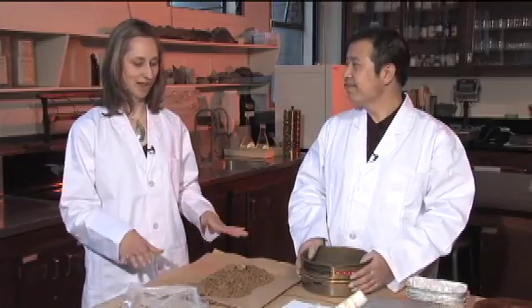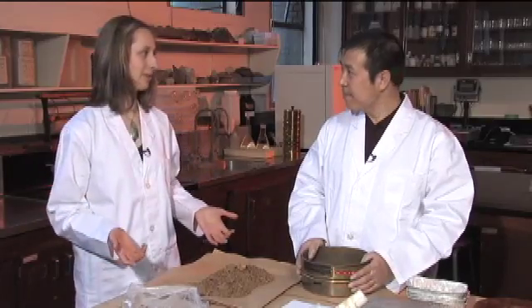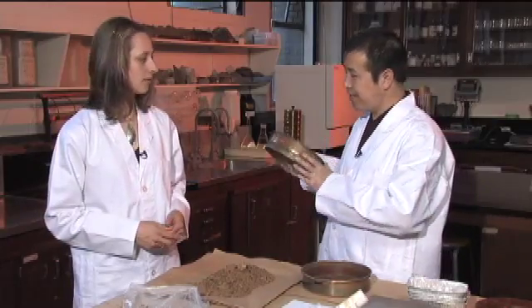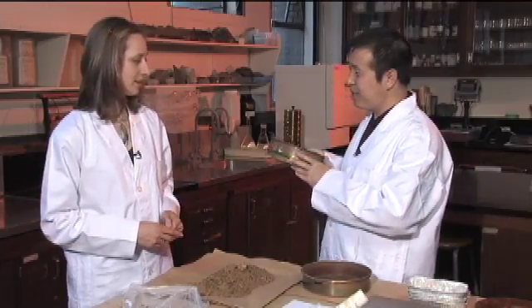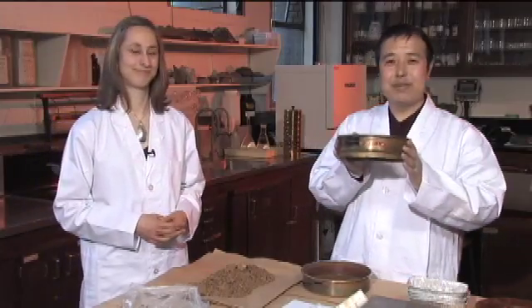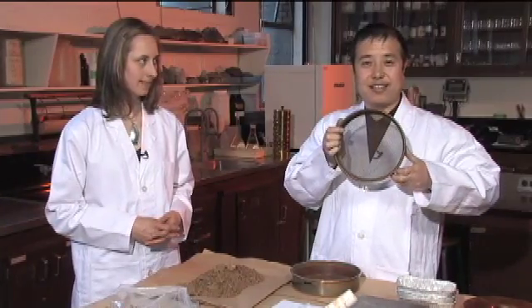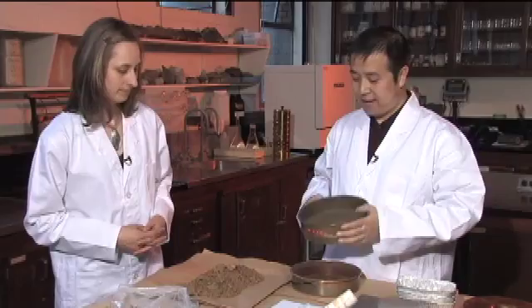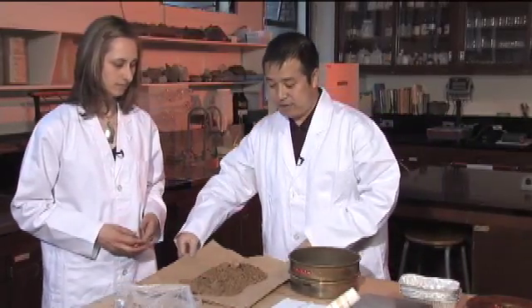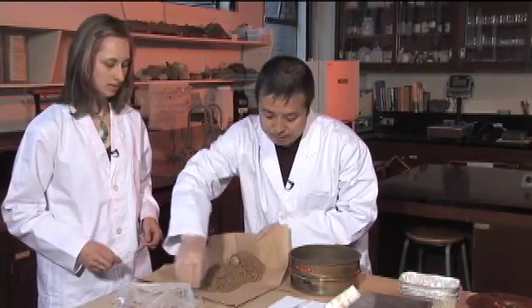We'll let it dry for a little bit so it's easier to sieve. What sort of sieve are we going to use? This is a number ten, two-millimeter sieve — the mesh size is two millimeters. Now we just need to transfer the sample from the paper into the sieve.